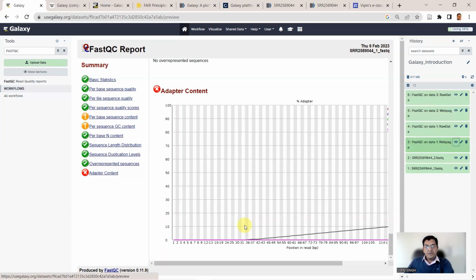So on that note, we close here, and I see you again with the next lecture, where we'll do a more formal introduction to FastQC and NGS data analysis.